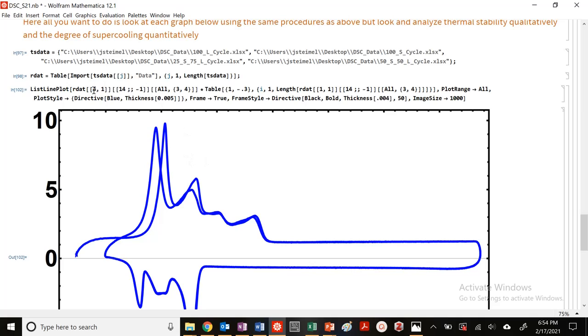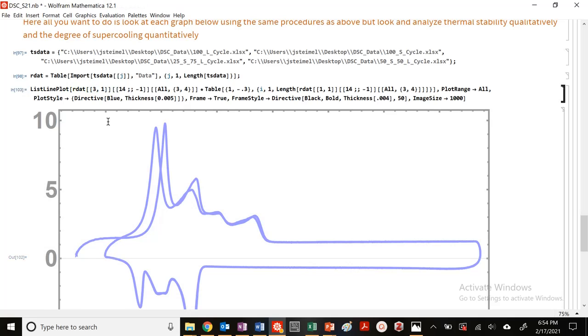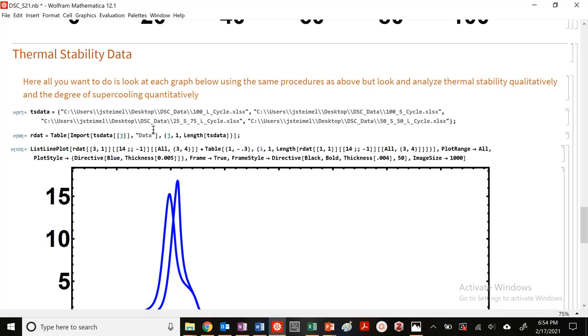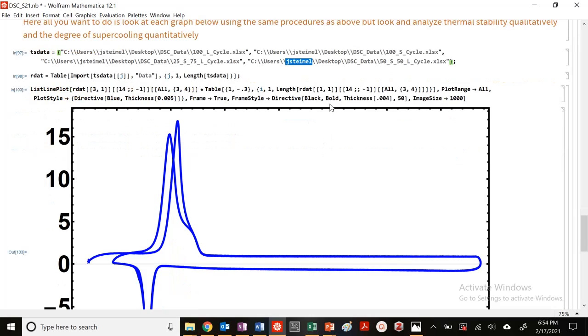And you can see for the eutectic, it's actually pretty good. There's a little bit of a shift, but again, it's better. And why is that? Why are the eutectic and these pure materials better than the 50/50? Because again, we're going from pure liquid to solid. We don't have solid phase transitions and other things going on here.